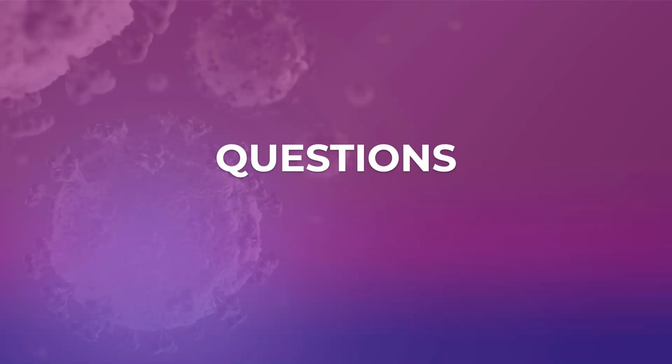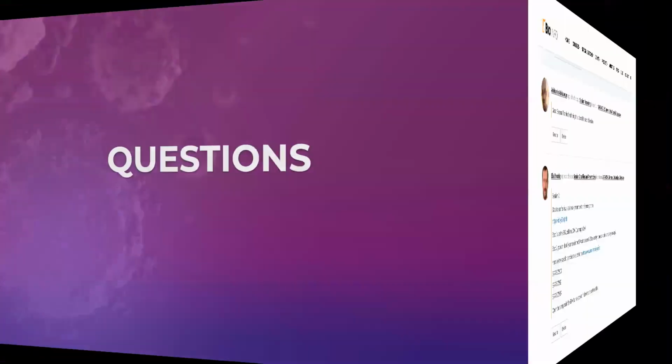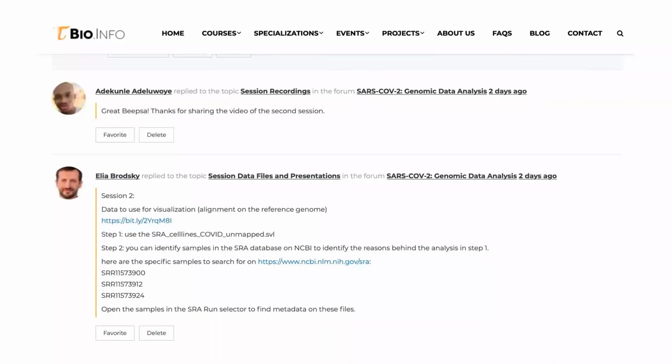Okay, so again, the goal of putting those questions on the forum is to help prepare any kind of specific material that we can review in these sessions. And here's an example. I posted this on the forum and it should have come up on the activity tab, where you can see from the previous session, session 2, we used data for visualization.